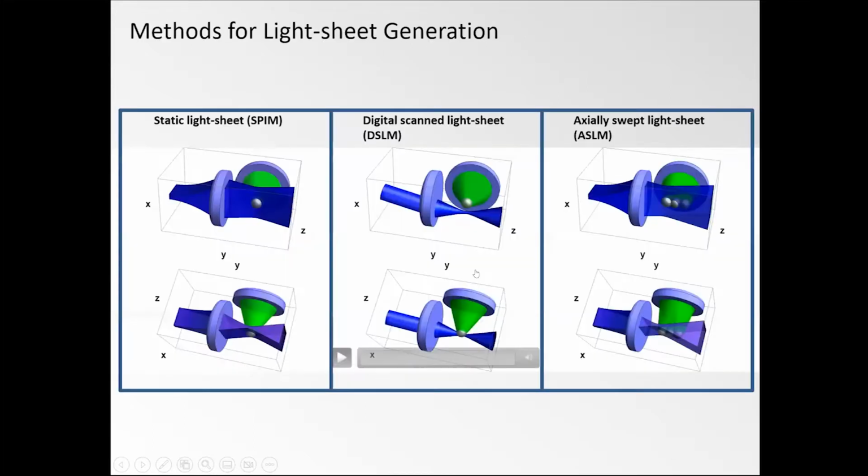Good. So there are hundreds of light sheet techniques, and one can argue, what's the common denominator, or what do they have in common? So one thing we can maybe spend a short amount of time on is how do they actually create the sheet? And I think there are at least 3 different variants that are worthwhile considering or mentioning, or you can argue you can construct all the other types from them.